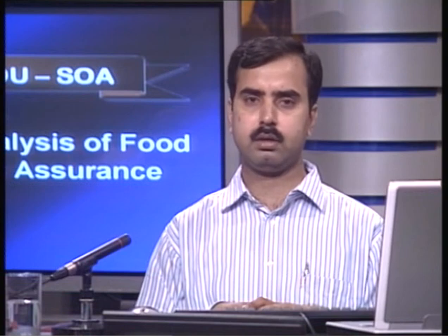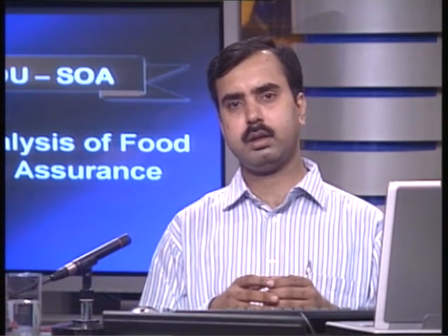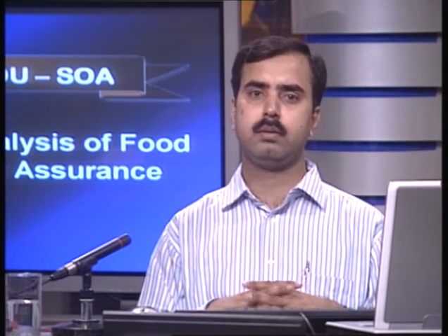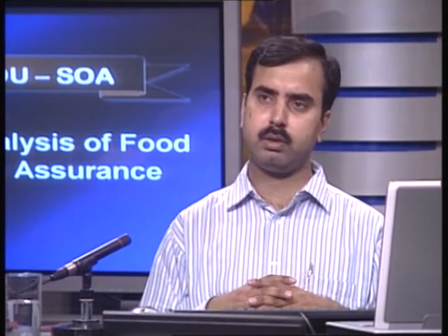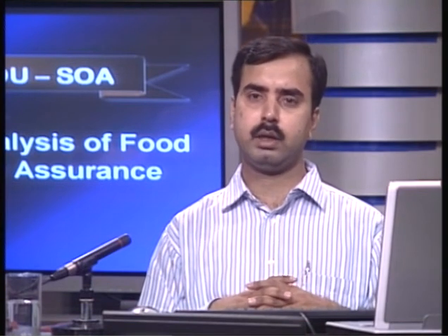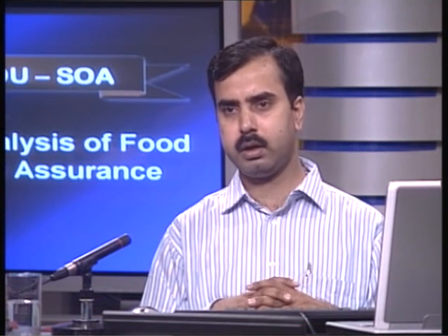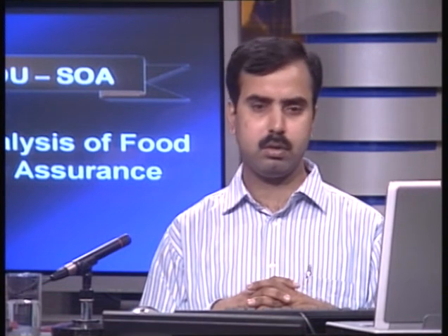The best I can do is explain how it works. It has some basic components like the mobile phase. The mobile phase is a liquid because it's liquid chromatography, and its composition depends upon the target analyte you are analysing in a particular food matrix.